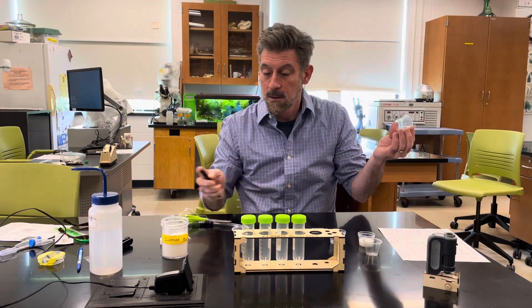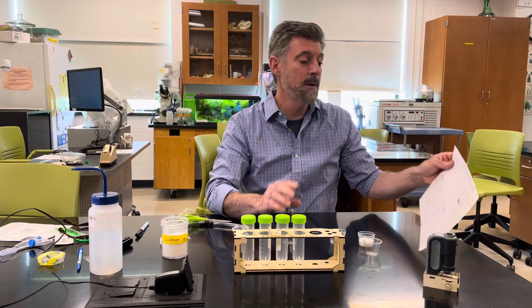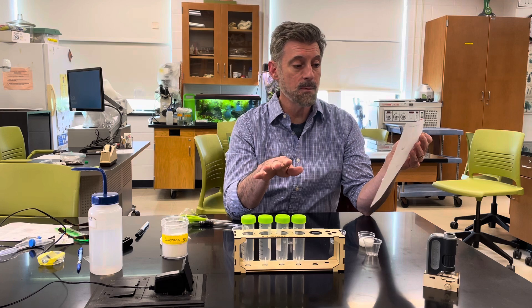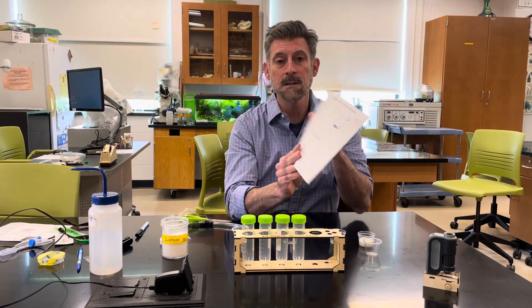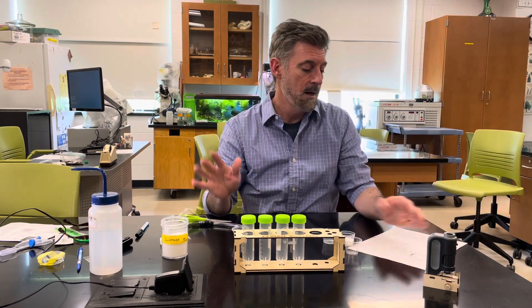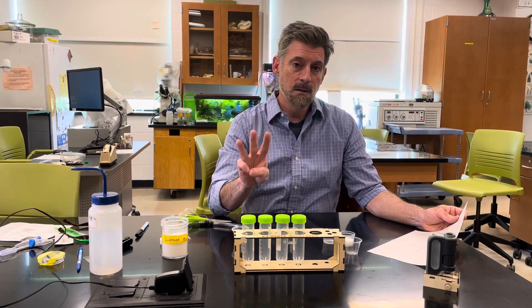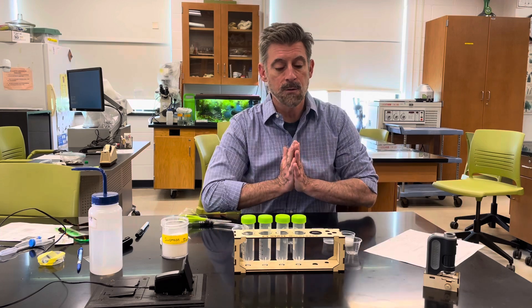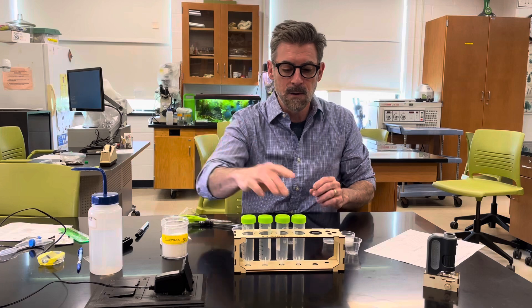In the experiment there are several things you have to do. The first thing is making up a bunch of solutions. You're going to use this sheet as a reference, and there's a set of detailed protocols and instructions online with your lab. You're going to make three sugar solutions, and the fourth one is just plain water, but we're going to treat them all the same way.